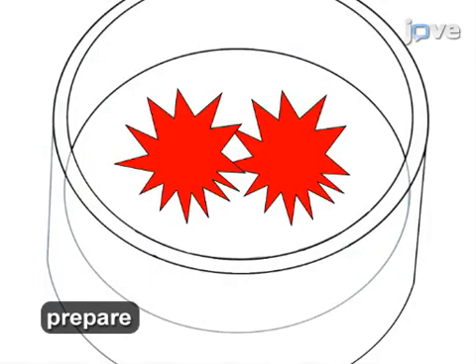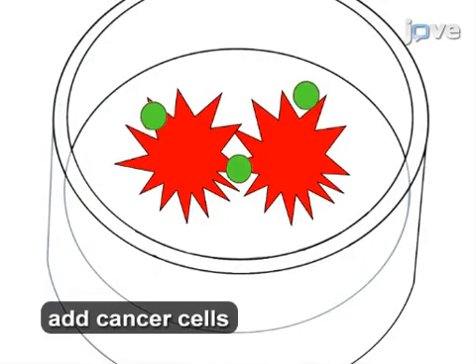Next, a plate is prepared with a cell-free NET isolate, and cancer cells are added to demonstrate how the NETs affect cell adhesion.